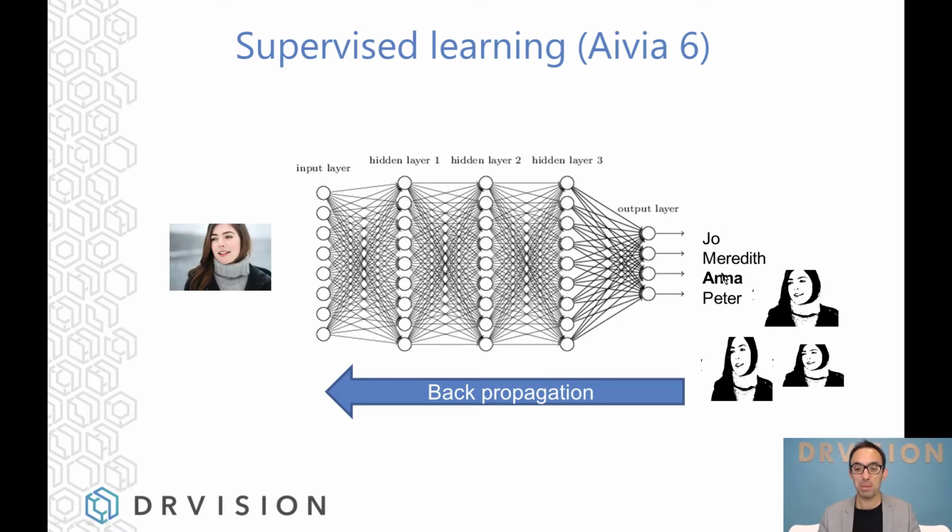so that this network can correctly detect which of these people it is. So if this is a picture of Anna, we would teach with many pictures of Anna, and by doing that, we would train this network to identify Anna in a picture. So if we provide different pictures of her dressed up in different ways, the network is going to be able to automatically identify her.